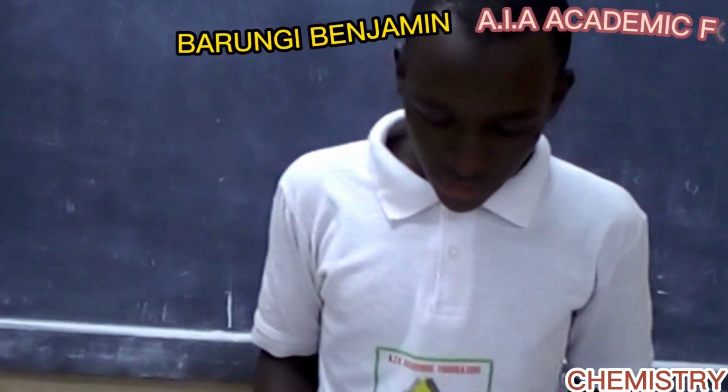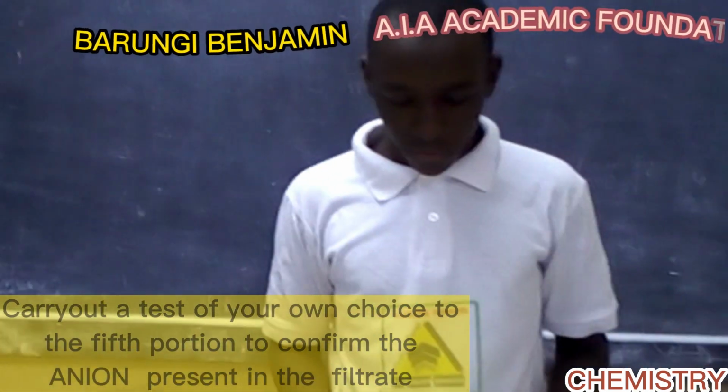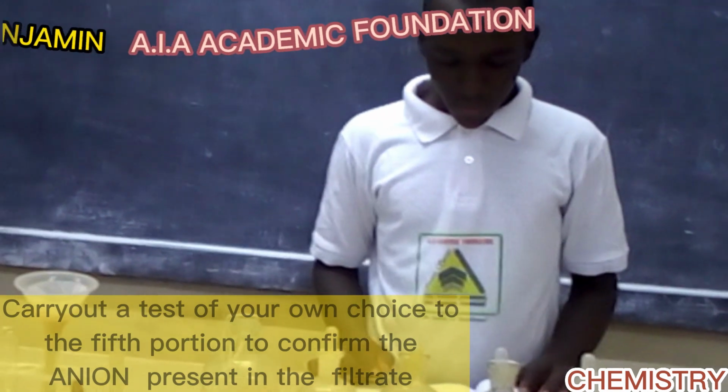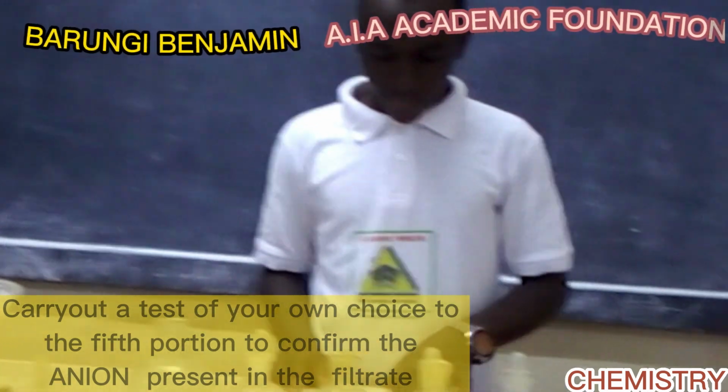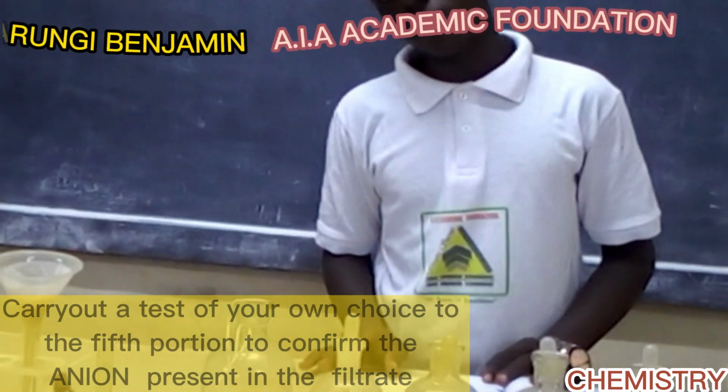Now they have told us to carry out a test of our own choice on the fifth portion to confirm the anion present in E, the sulphate ions.